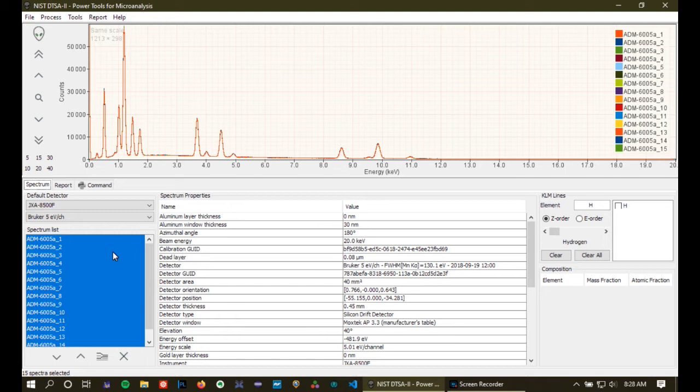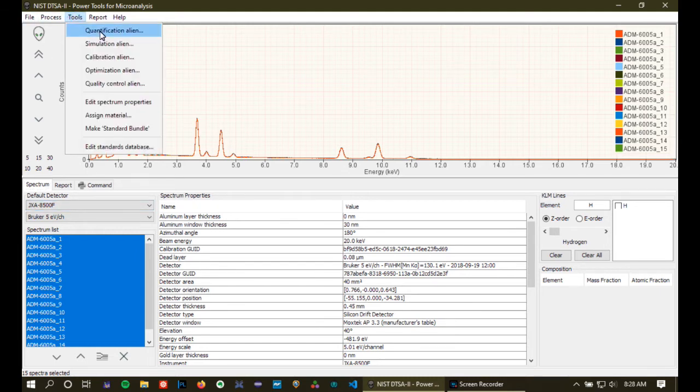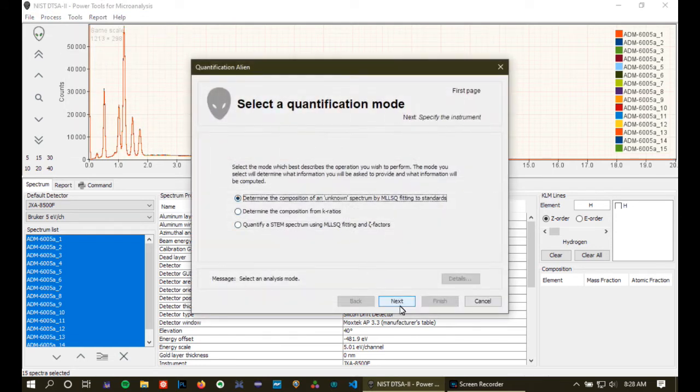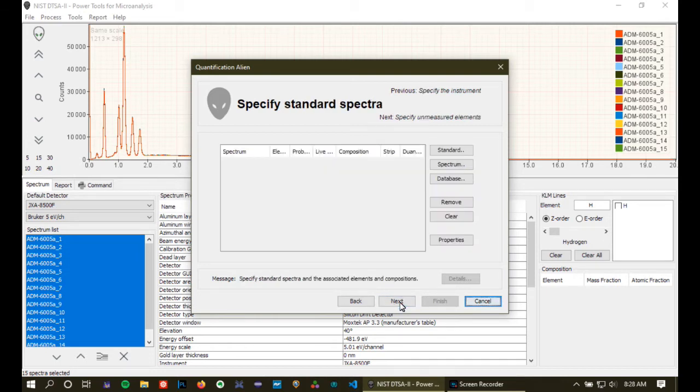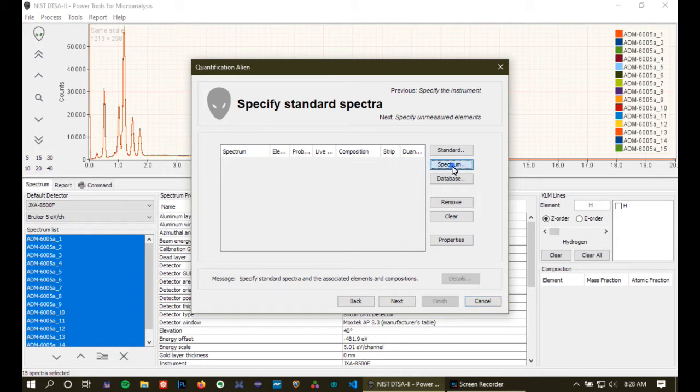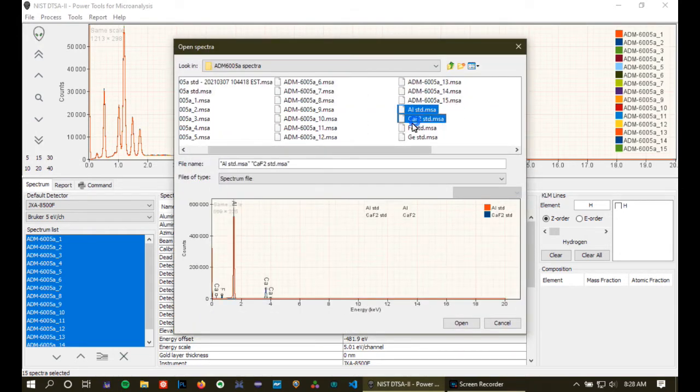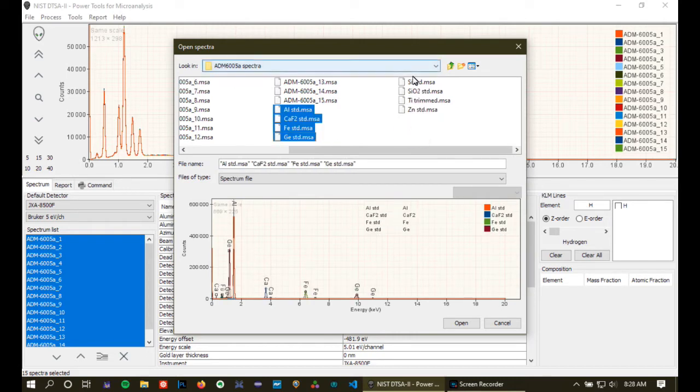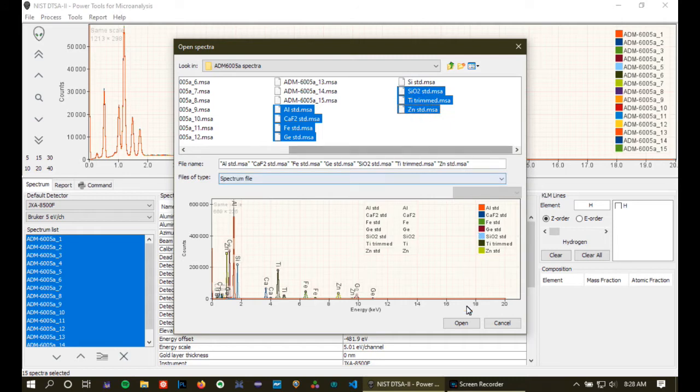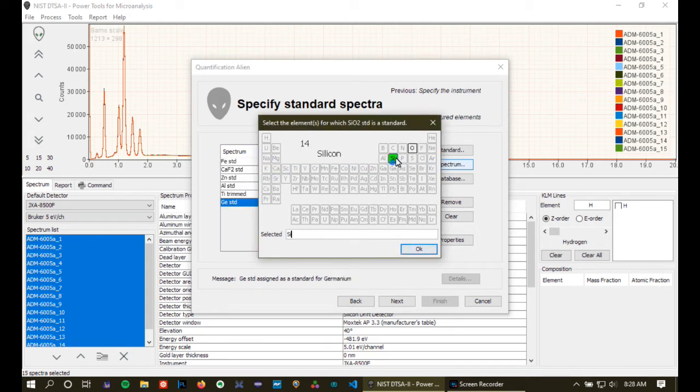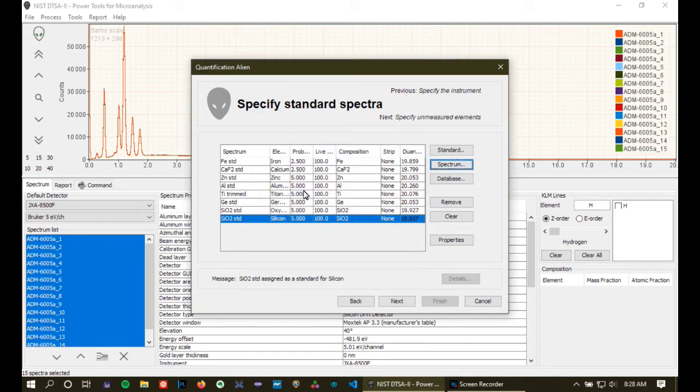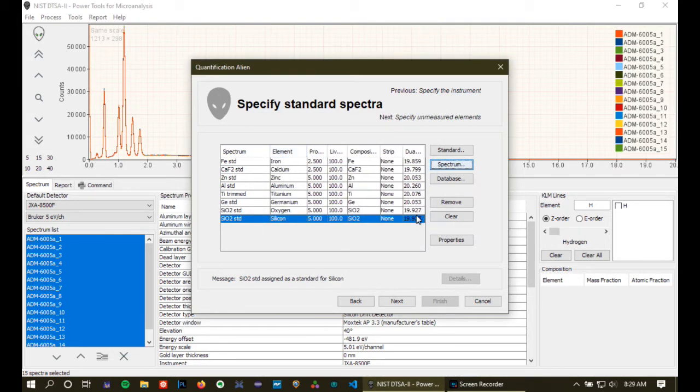The first thing I actually recommend you do is go ahead and actually quantify this. So I'm going to go up to tools and I'm going to select the quantification wizard and then I'm going to just step very quickly through this but I'm going to use spectra to quantify this and so I'm going to pick out a series of spectra that I collected before and use these as my standards to quantify this material. So using calcium fluoride for calcium, SiO2 for both silicon and oxygen.